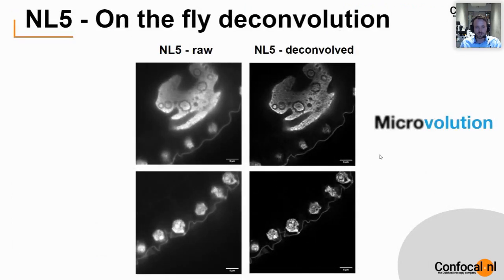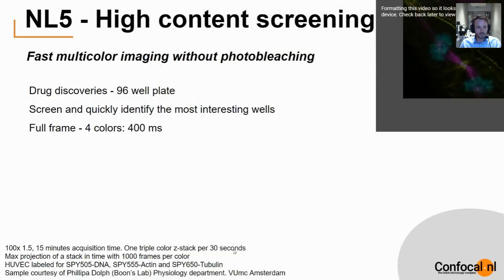Here you see the effect of deconvolution. I'll also show that during the live demo. So we have an on-the-fly deconvolution tool that can improve the image quality further. And the final video will be about high content screening applications, where you want to quickly scan through a well in multiple colors and identify the most interesting wells.